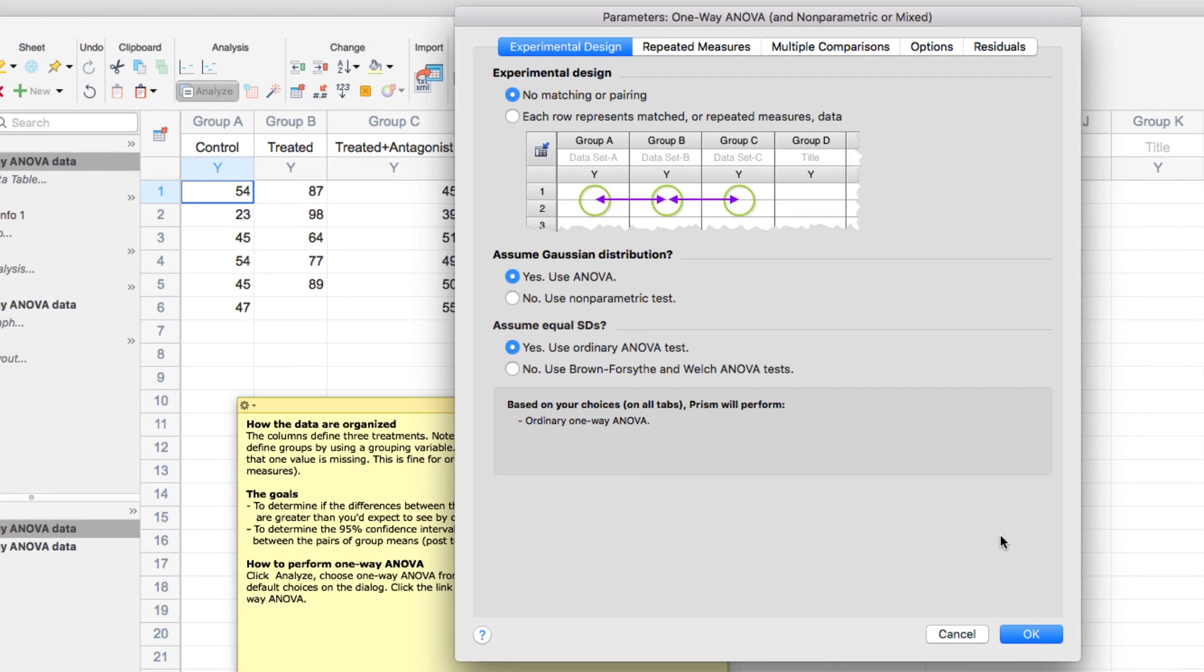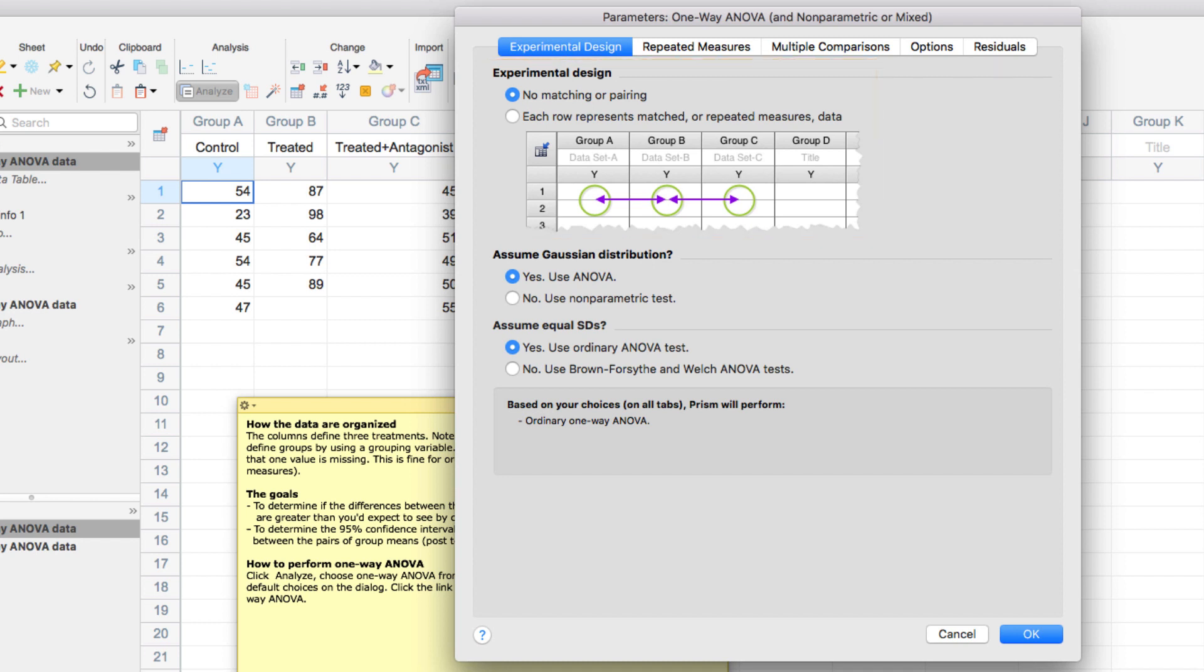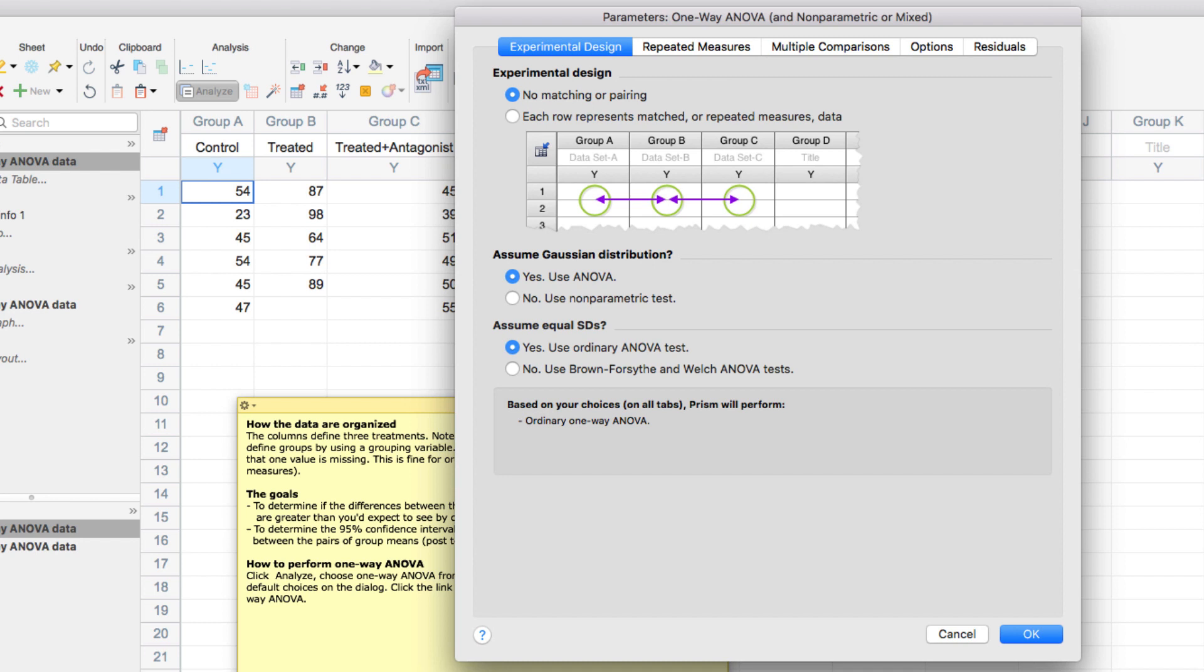In the dialog that appears under the very first tab of Experimental Design, you'll be able to make any necessary changes to the analysis based on your own experiment. For example, whether your data were matched or paired, or whether you can assume that your data were sampled from a Gaussian distribution. Other options for the analysis can be found in the various tabs of the Parameters dialog. For example, the main test of an ANOVA looks at three or more groups and compares their means or averages. However, the main test doesn't report any information on the means or averages of any given pair of groups.